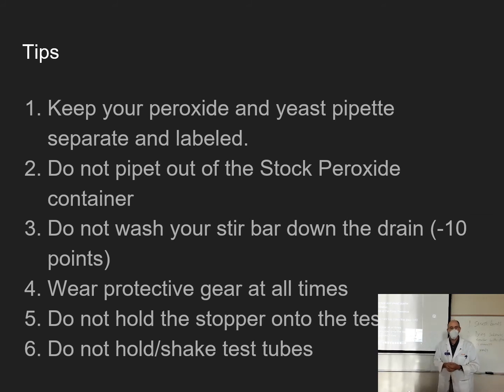Here's a big one. Do not wash your stir bar down the drain. Students often clean up and they forget there's a little magnetic stir bar in their cup, and then it goes down the drain. Those are stupid expensive for some reason, so don't wash it down the drain. What you can do is catch it in that little strainer that you used last time to catch your potato bits. Just catch it when you're done. And I put a threat up here of minus 10 points if you put your stir bar down the drain. So I want to see your stir bar stuck back to your stir plate at the end of the day.